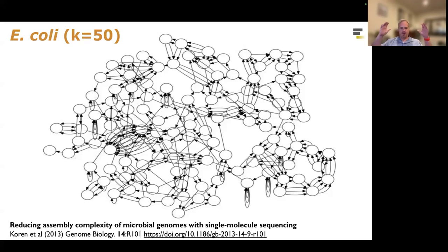So we're going to take the original full genome and extract the first 50 characters, then shift over by one, the next 50 characters, and so on, over the entire 5 million base pair sequence. The initial graph will be about 5 million nodes long because the genome is about 5 million bases long, although the little sequences upon them will each be 50 characters long. That'll be the initial graph.